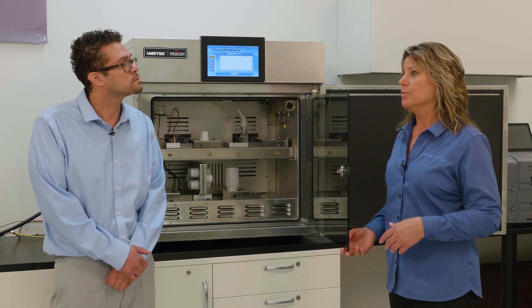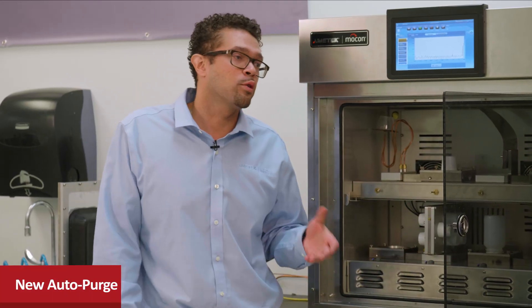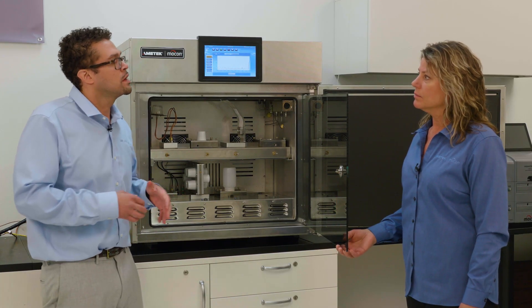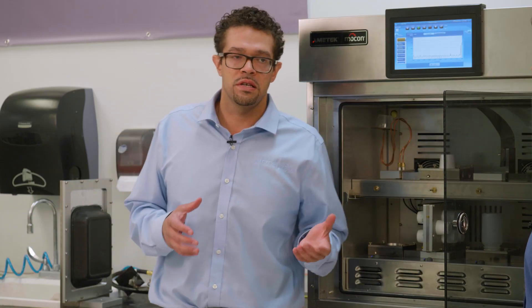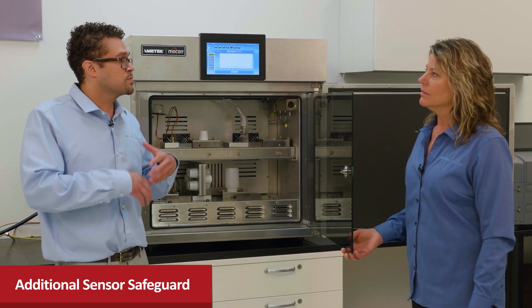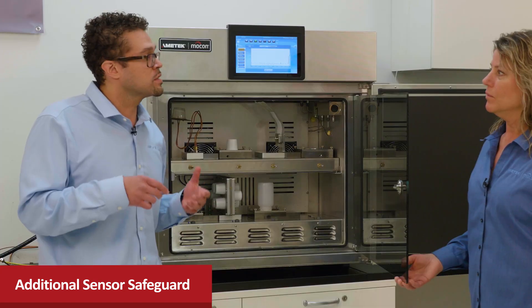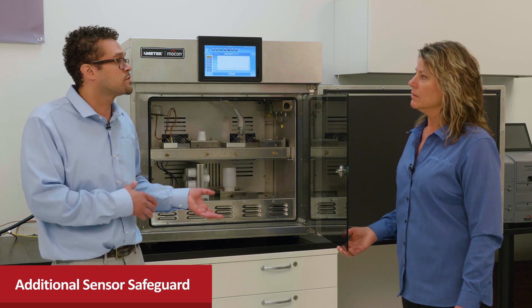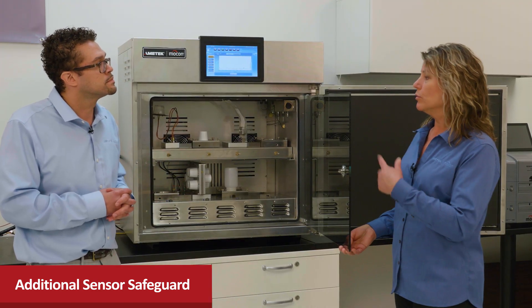So what new automatic features allow this instrument to complete whole package testing faster? We have an auto purge feature. What that does is it allows one to purge the volume of ambient air out of your package 20 times faster, so we've really speeded it up on that front. We also have the conditioning quick check — when you set your package up for conditioning, you have an auxiliary O2 sensor that will monitor what the oxygen level is within that package before it inserts it into an active test. Why this is huge is because we've all had the pain of testing multiple samples — say we set it up on a Friday, one had bad epoxy, it fails out all the samples we were testing and we lose the whole weekend. With this instrument, that can never happen because it would keep that bad sample from being introduced into an active test. With the alterations made for the sensor, we can also test at shorter exam times, which improves throughput and keeps testing going.